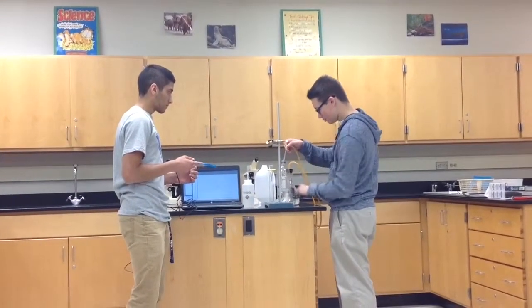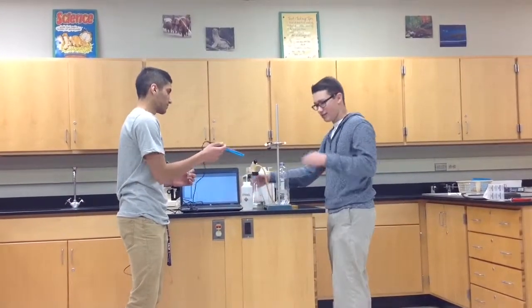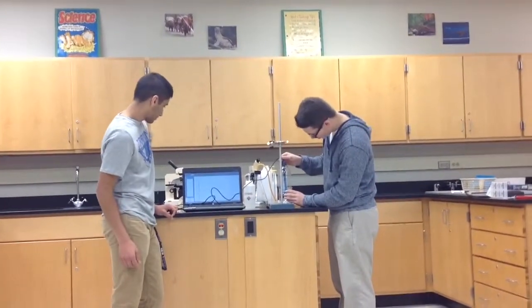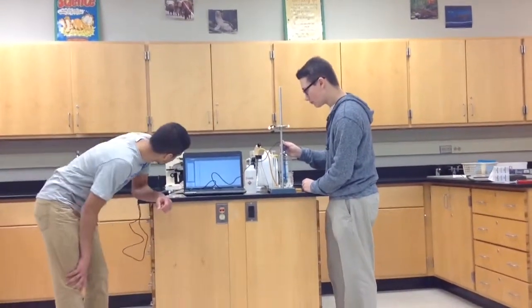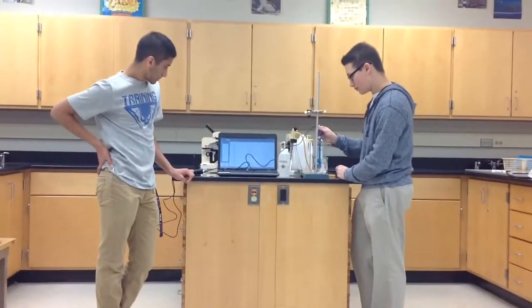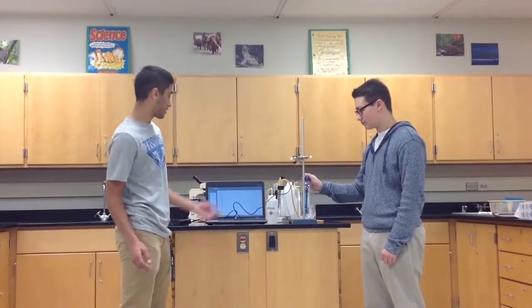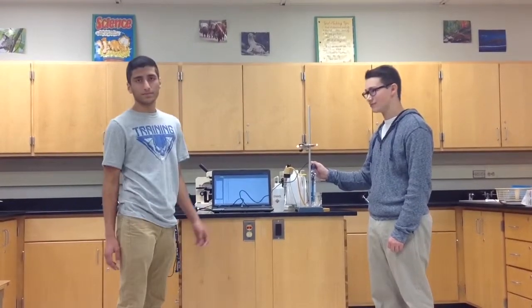We're going to remove this. We'll take the pH meter here and we'll stick it in the water to see what it gets to. It looks like the pH has reduced a little. It's starting to decrease. Okay, so there was a significant reduction in pH, and the pH looks to be about 4.33.